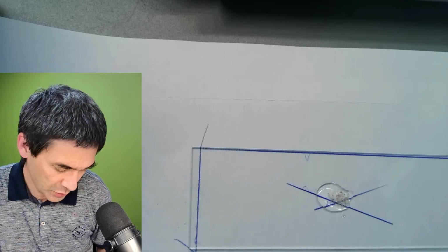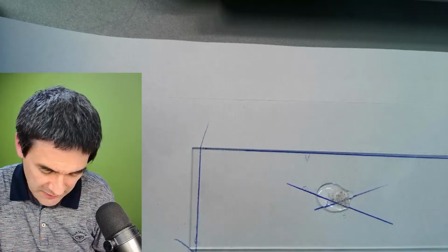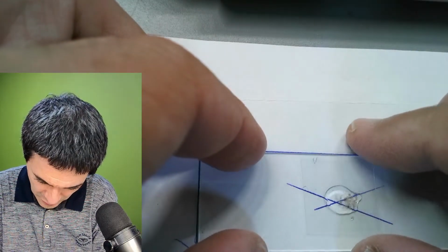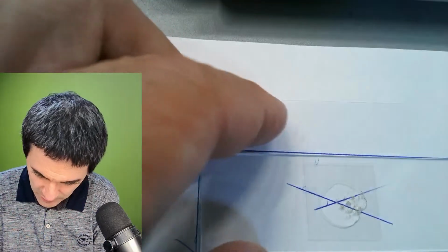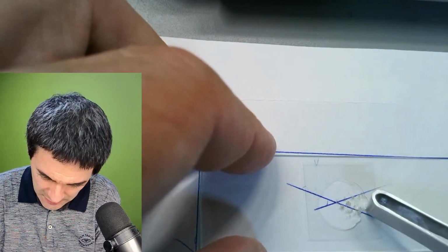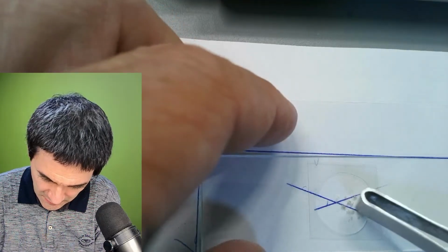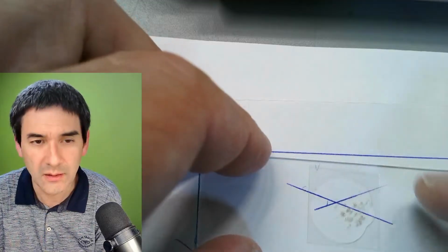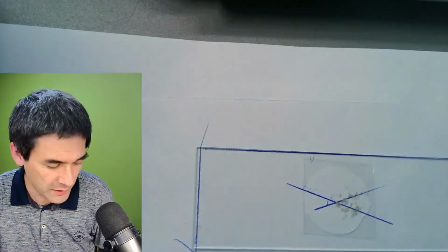Cover glass goes on top. Those cover glasses luckily are reasonably clean. You can let capillary action do some of the work. And we're going to press it flat. Usually it's going to spread a little bit. You have to be careful that not too much of the glue spills out. If it does, then you can always remove it.